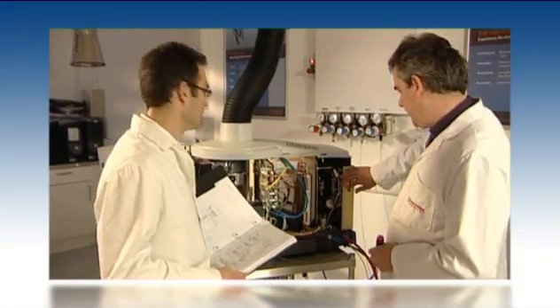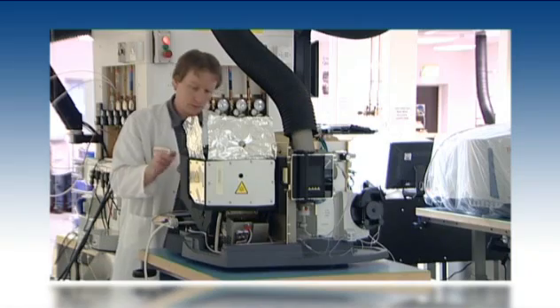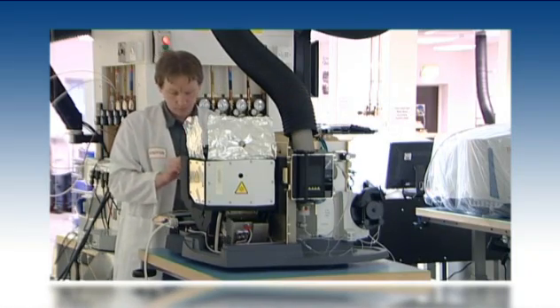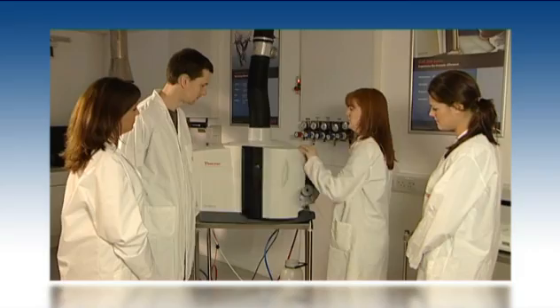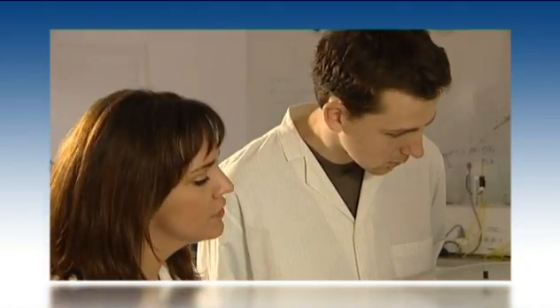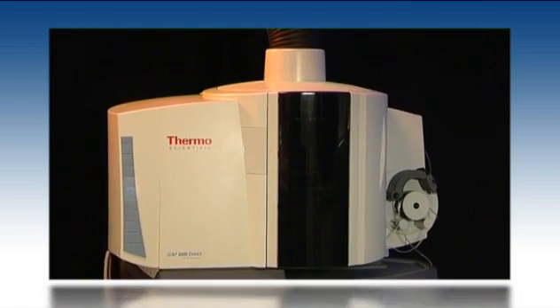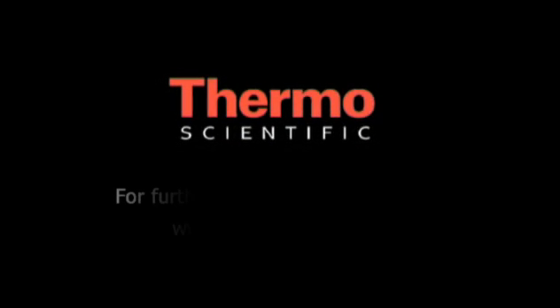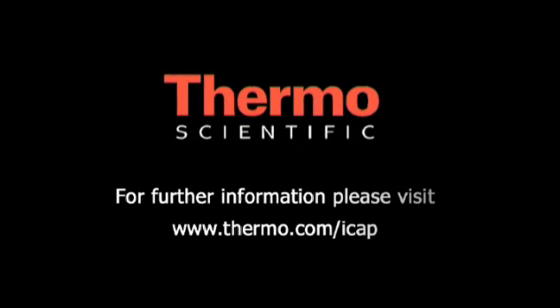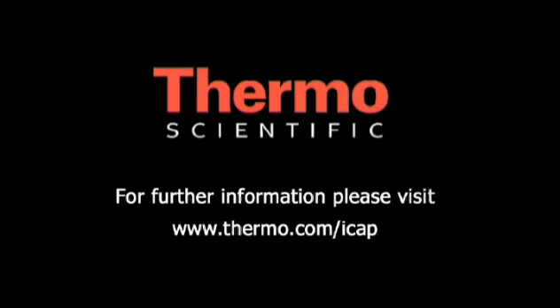The iCAP 6000 is manufactured to the highest quality standards in our state of the art production facility, and Thermo Fisher Scientific offers comprehensive support coverage with local responsiveness. The iCAP 6000 series ICP — experience the dramatic difference. For more information, visit www.thermo.com/iCAP or call your local sales office.